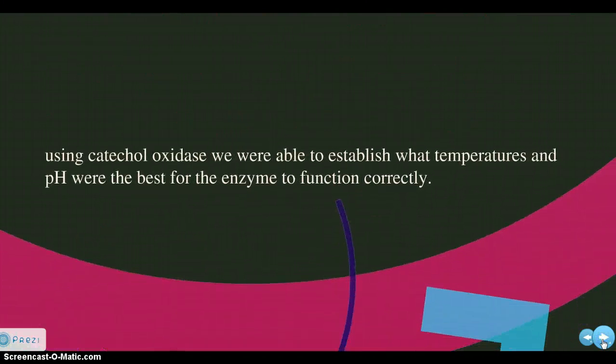In this experiment, what we're trying to establish is an enzyme's prime temperature or pH, and how having the prime temperature or pH affects its function. How does it better it? How does it lessen it?